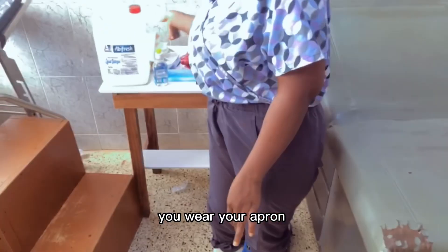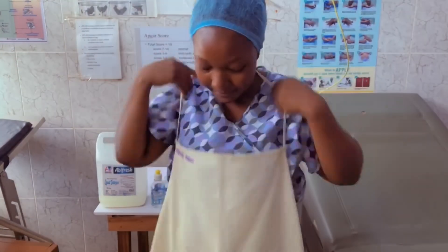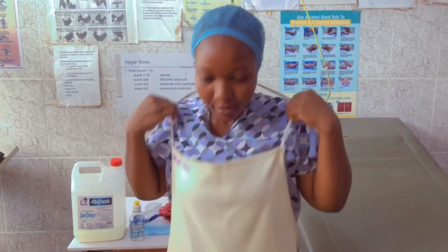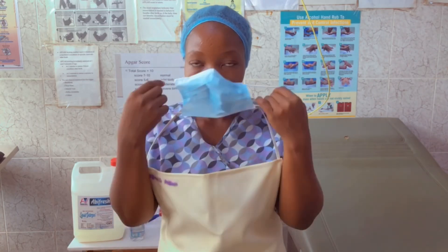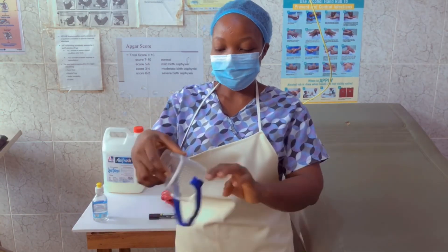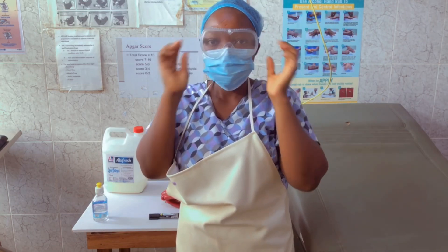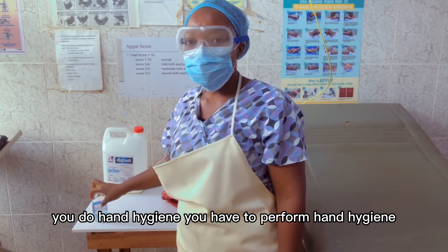After that, you wear your apron, and then your face mask. Remember to protect your eyes, so you wear your goggles.